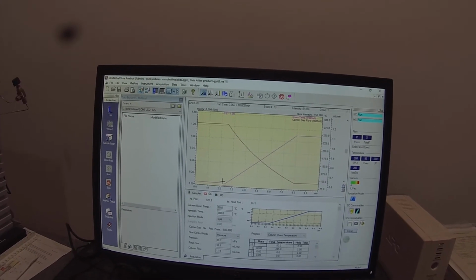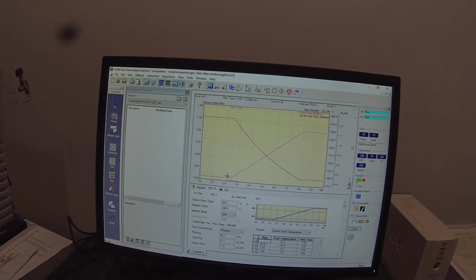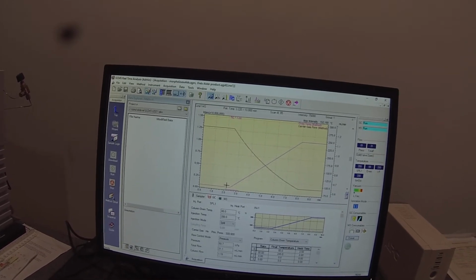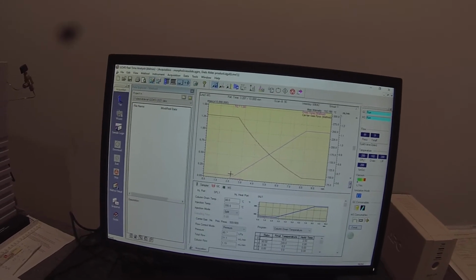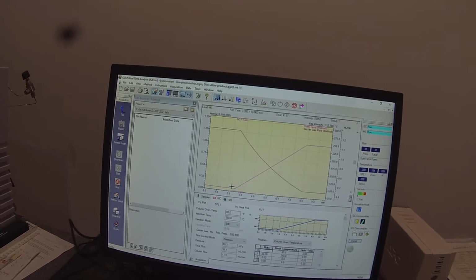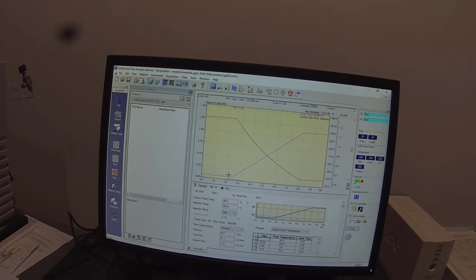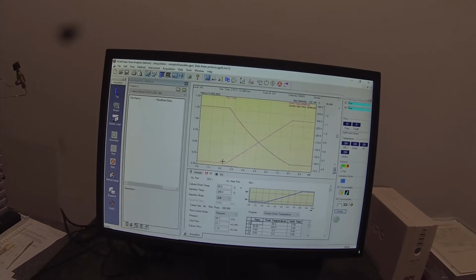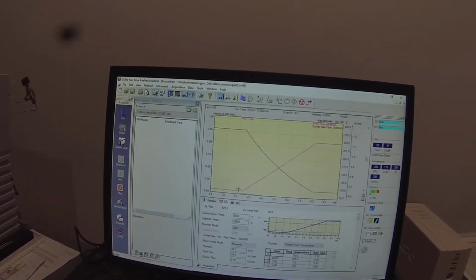We do know that this product comes off a GC column because we followed this reaction by GC. But it may require a higher temperature to get it through this longer column. This is a 30-meter column, and that was a 15-meter column. And we also are not entirely sure what our flow rate was. We're at 1.19 milliliters per minute here. But we're not exactly sure what the flow rate was on the GC because the split was 6 turns open.